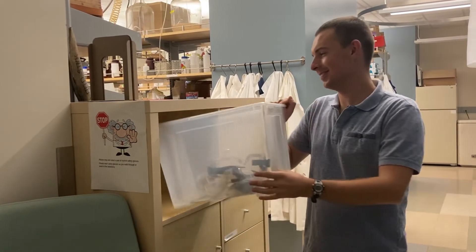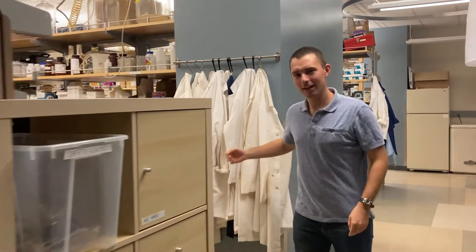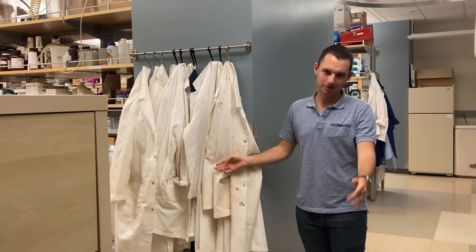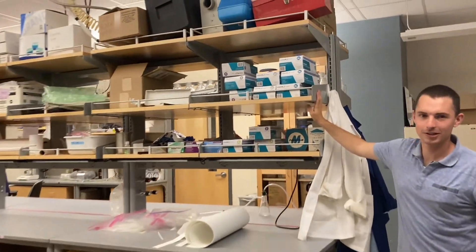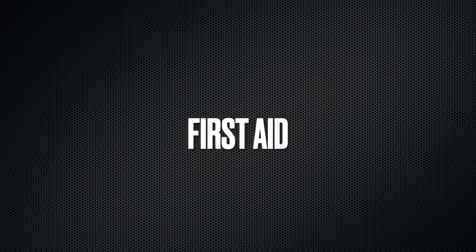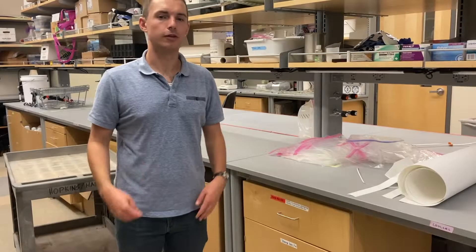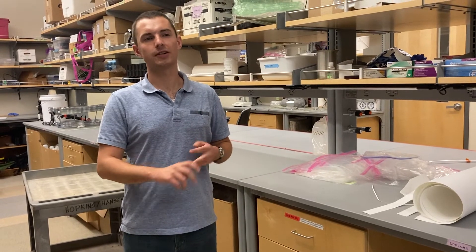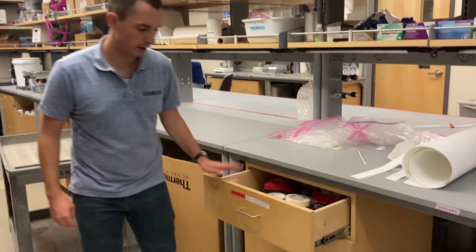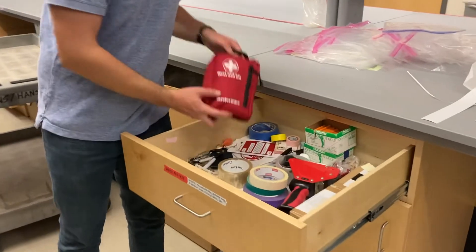Safety glasses are here. Lab coats for use are here, or you can bring your own. And gloves are all here. For any minor injuries — such as a cut, a burn, or anything else like that — we do have a first aid kit kept in this drawer right here in this little bag.